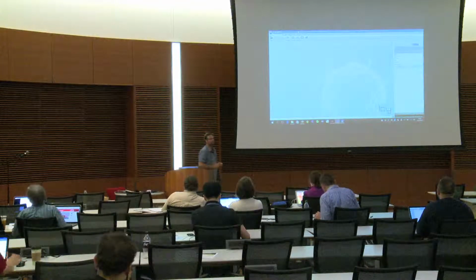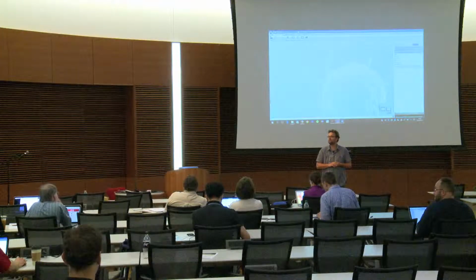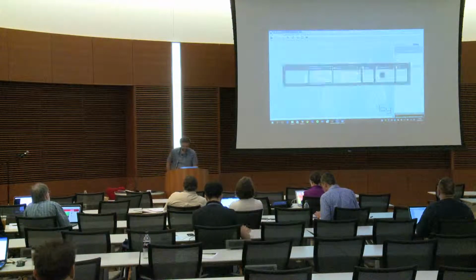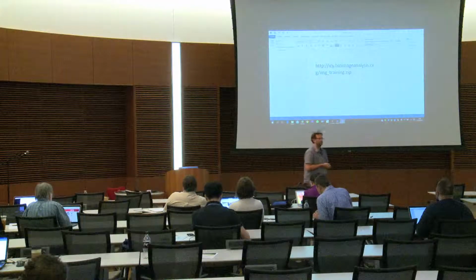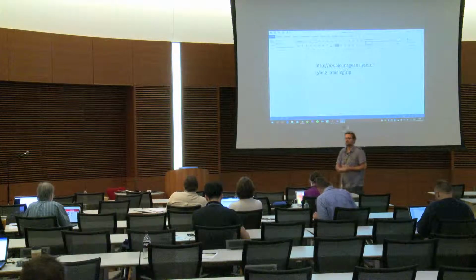I think for the beginning, as you are downloading the app, I will do some trivial operations. The beginning is always difficult because of those prerequisites.